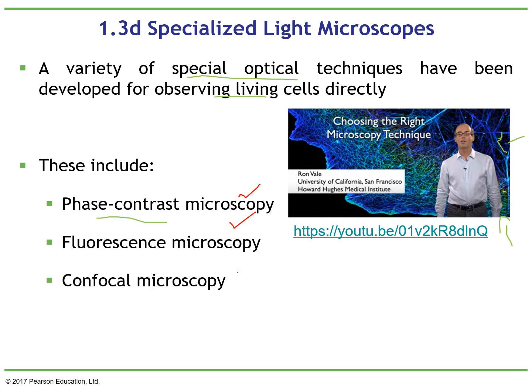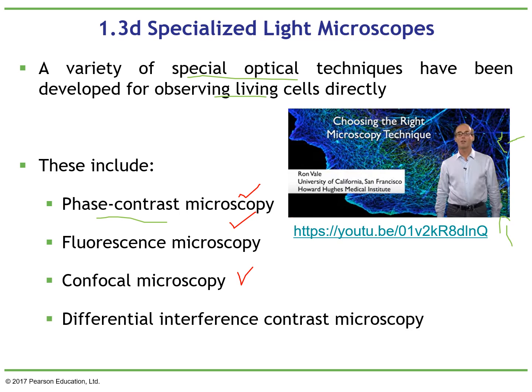My movies use confocal microscopy, and this one that we talked about in the past, DIC, differential interference contrast microscopy. This is the one that gives you images that look 3D. Yeah, confocal microscopy will also give you pictures that look 3D, but using fluorescence. Let me talk about this in the following slides, and over the semester we will talk in more detail about those.